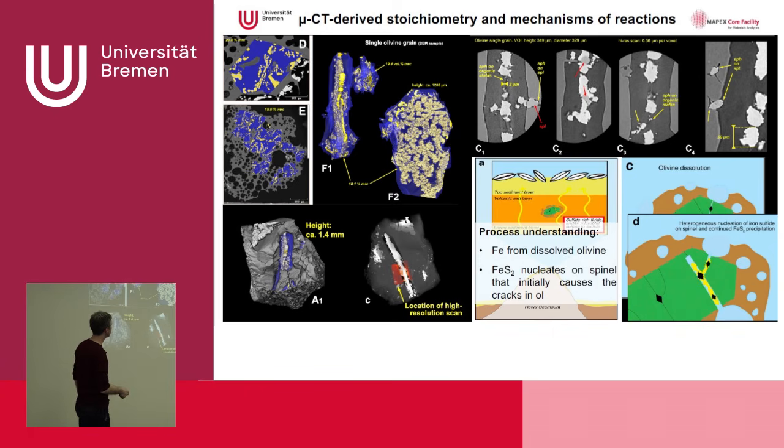And this is something that's very nice, because we gain a process understanding. If we look at these kinds of scans, something no other method I used can tell, because we have the 3D picture of the substance, we can make volume calculations that I cannot do by SEM imaging or something else. So that is really an interesting process that maybe can also give you something to think about in your environments, in your samples, what you could do with it.